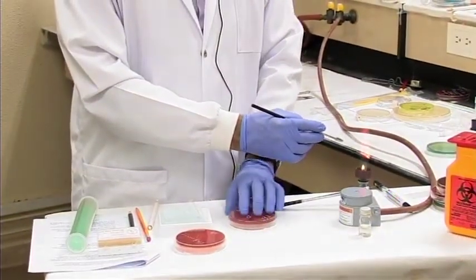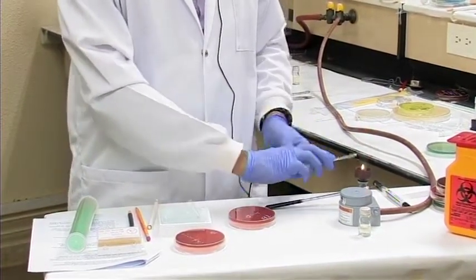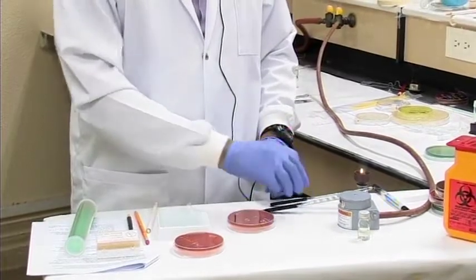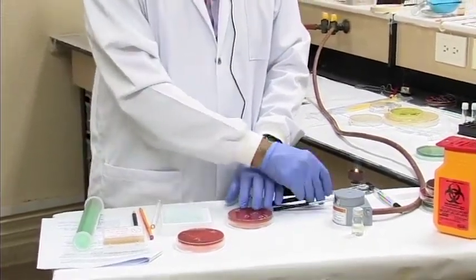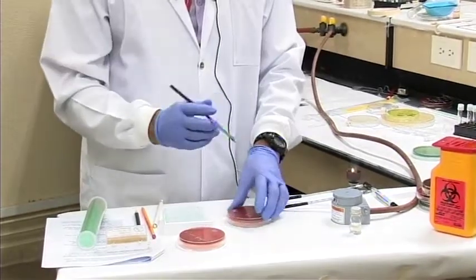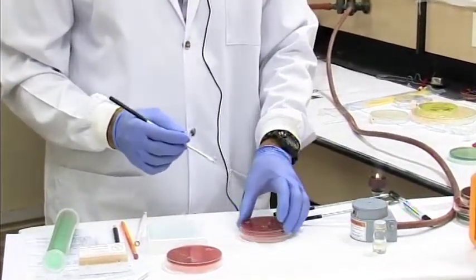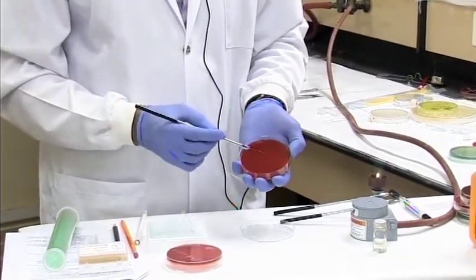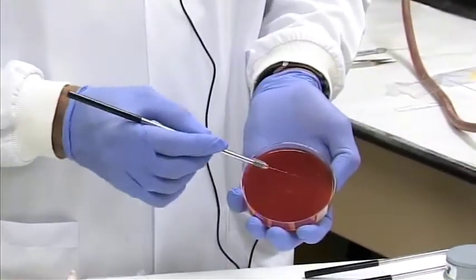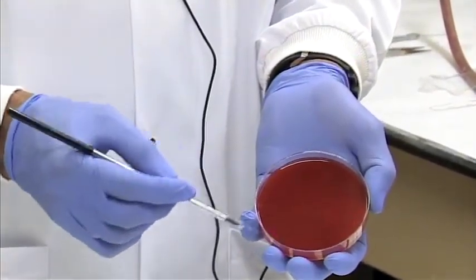This part is especially important in terms of contamination. Namely, again, when streaking a plate, one must not be speaking, so that droplets can't land on the plate. But of course, for demonstration, I'll be narrating throughout the process. So we're going to streak our plate in what we call quadrants. So I've done the first quadrant. So I'm going to use another loop now, cooled, and go back to the previous line of streaking and pull out about 3 or 4 times, and then a couple times outside that section.